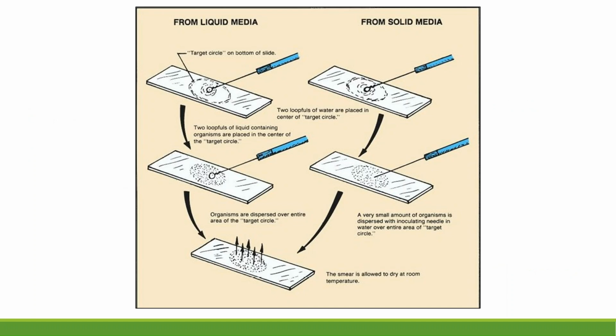Again, we don't want to have too thick of a smear, or else bacteria will lay on top of each other and block out the light for each other. So we must avoid having that too thick of a layer there, so that we can get a clear image of each one of those microbes.